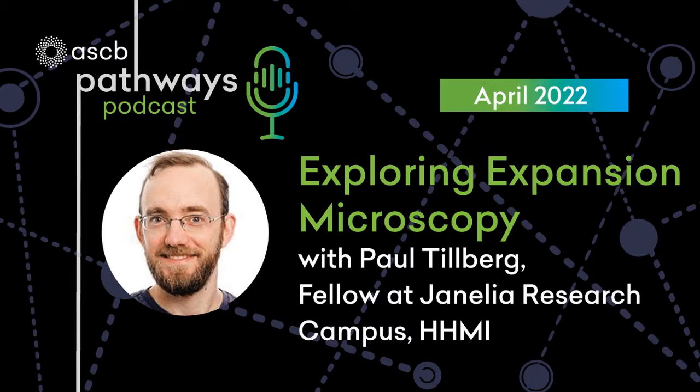Now what comes next is the expansion part. And this is kind of the version 2 that people actually use now. I'm not going to get into the original way we did it. The way that people do it now is you put on a small molecule. Usually people use a molecule called acryloyl X or ACX.